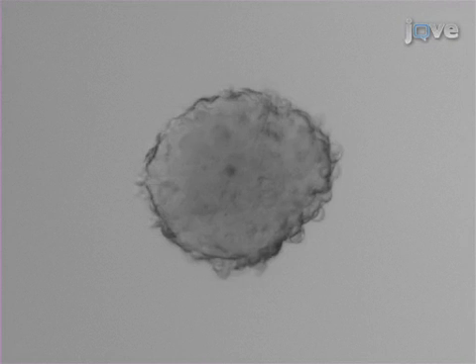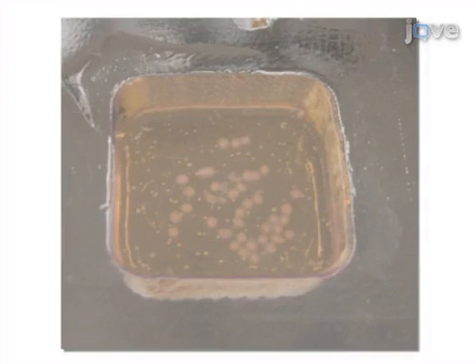Spheroids will form by day 3 or 4, and their growth and integrity are monitored by phase contrast microscopy. In order to study their histology, the 3D spheroids are embedded in warmed histogel prior to routine paraffin processing.